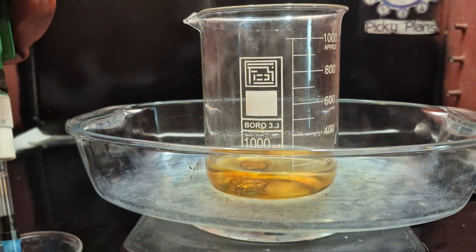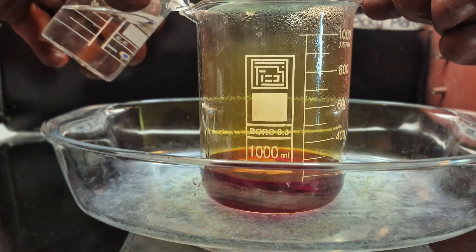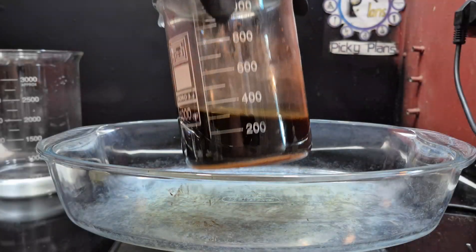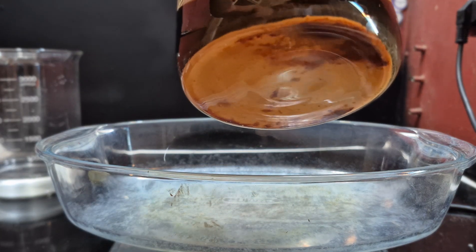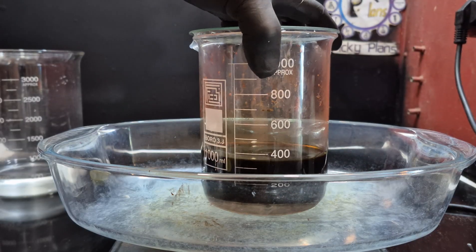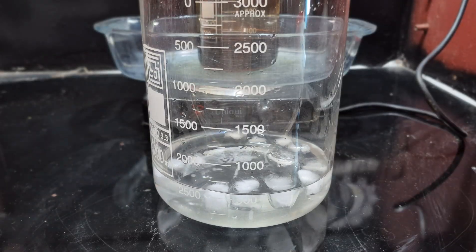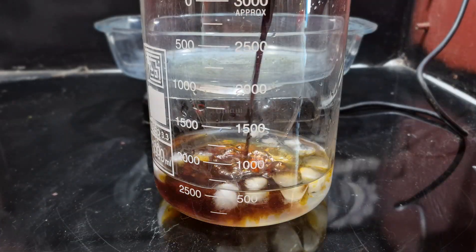Next I slowly added nitric acid, continuing the process until all of the palladium had dissolved. You can see that the silver has turned into silver chloride and settled at the bottom of the beaker. To force the remaining silver chloride to precipitate, I poured the mixture into ice water.